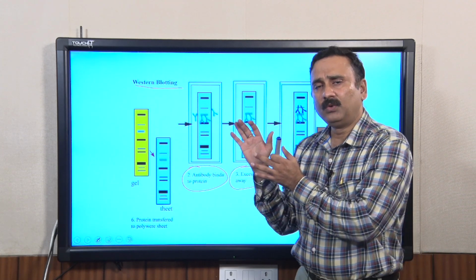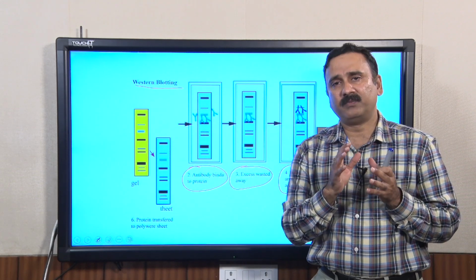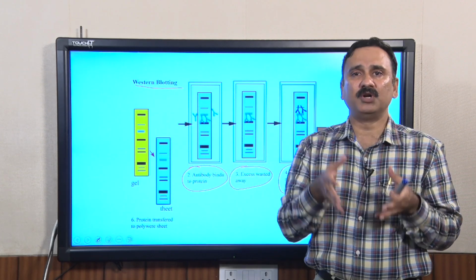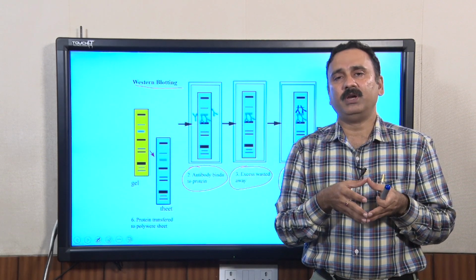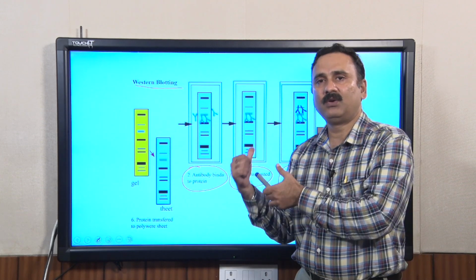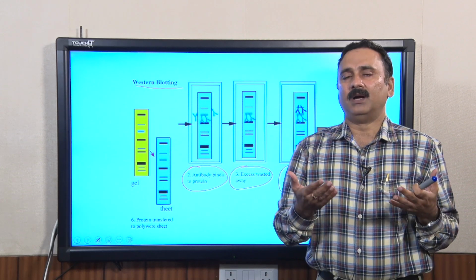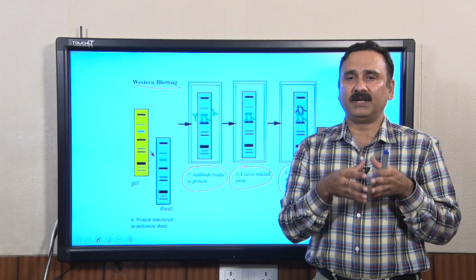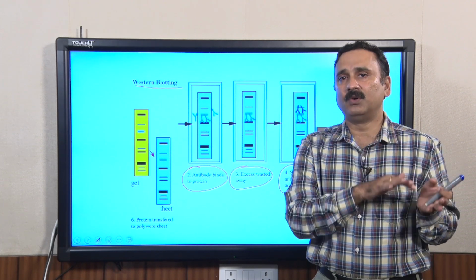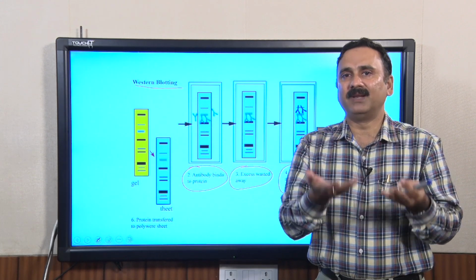To show you a small demo of how to perform Western blotting, we have performed all these steps in our laboratory, and Banesh is going to show you all of them, so that you will not only get the theoretical knowledge, you will also get the practical knowledge about how to set up these cassettes, how to transfer the gels, how to do primary and secondary incubations, and how to develop the blots.